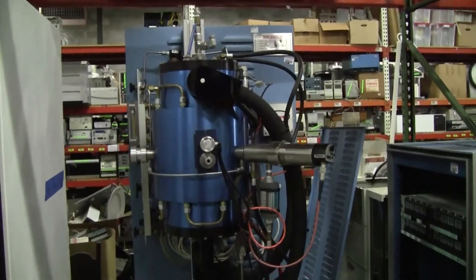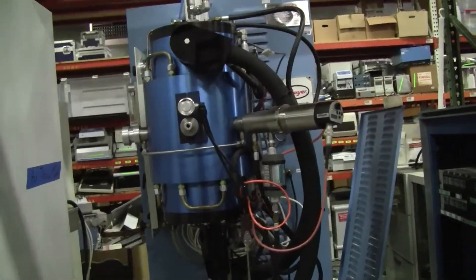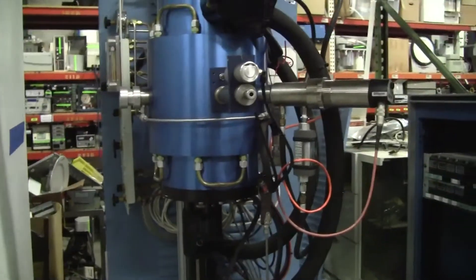Hi, this is Michael Natow from Hi-Tech Trader. Today we're looking at the high-temperature vacuum furnace.